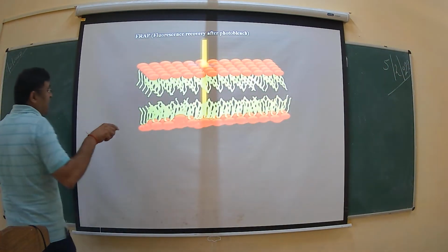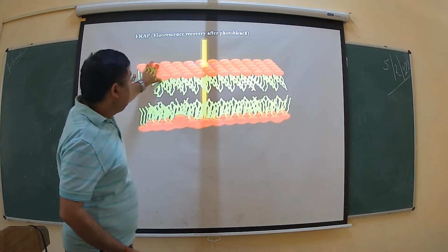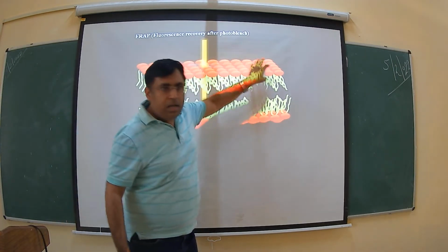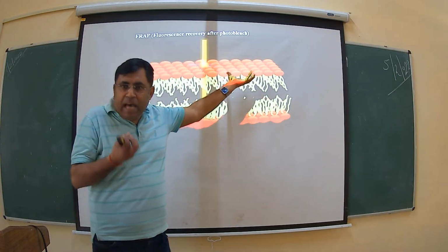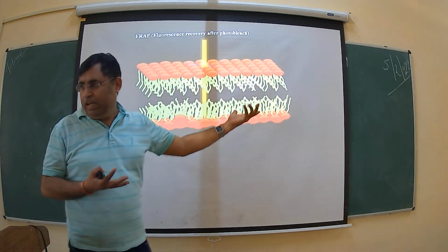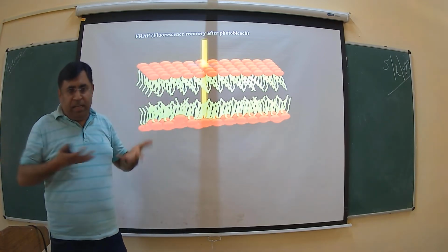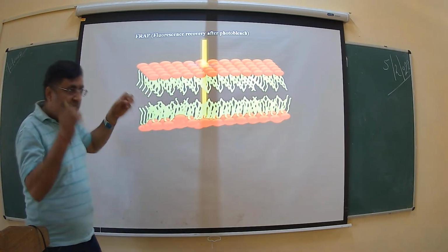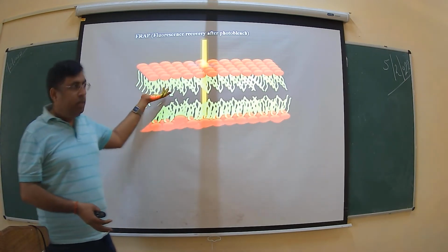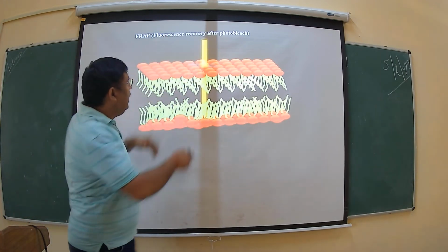This phenomenon is a high intensity light. So again let me explain. This is the red fluorescent light where you can see all these plasma membrane proteins appear red in color, and the lipid molecules appear green in color. Got this point? So this is the fluorescent light where you can visualize it, otherwise we cannot visualize it. Okay, so we stain the plasma membrane with some red and green. Got this point? Now what we do is photobleach. We put a high intensity light on this particular area.